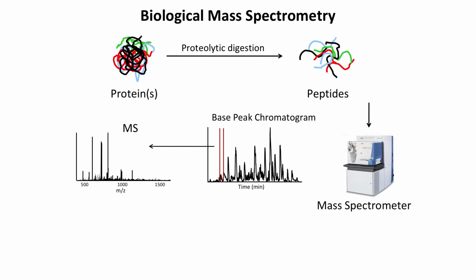So we inject them with an HPLC. The HPLC peak is maybe 20, 30 seconds wide. And your peptide that you're interested in is most definitely going to be right here, where the previous speaker said, the abundance bias. If you're a peptide that is here, you always get picked for sequencing. If you're down here, it might be very difficult. In this, again, it just gives us a peptide mass, not the peptide sequence.